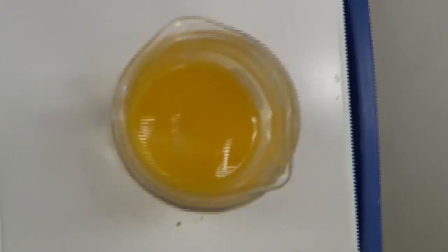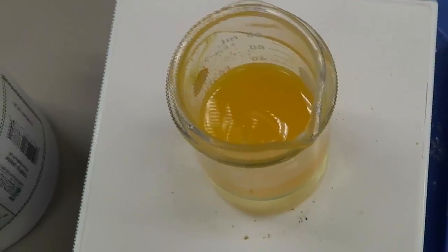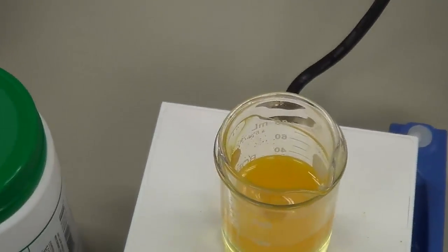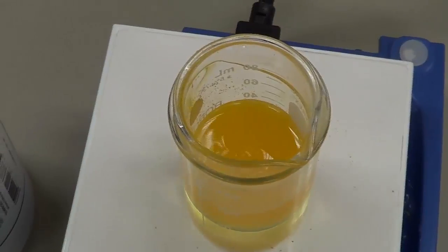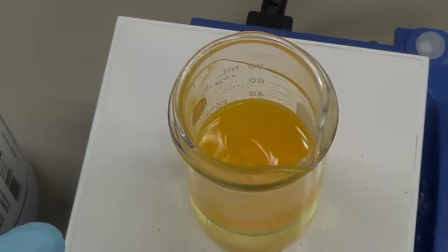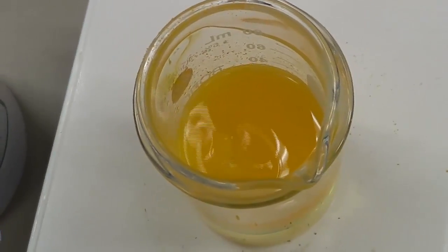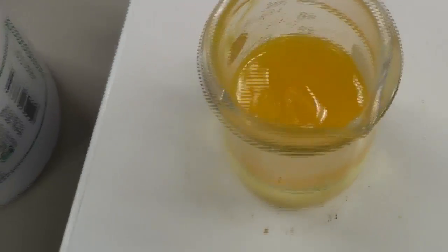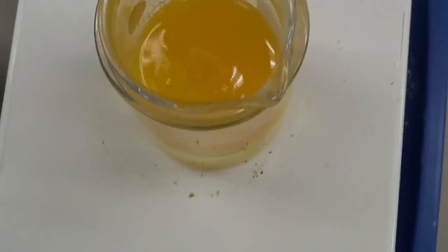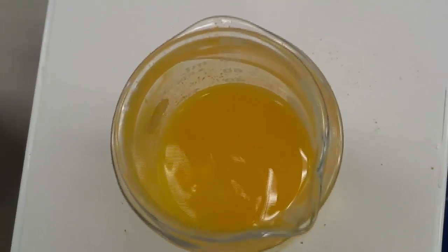Here are a couple of questions before we go further. I hope you remember the double casting technique. If you are aware of the double casting technique, you know the density factor calculations. The amount of base that I'm using for these troches is based on the earlier calculations that I already did. If you don't have the density factor, make sure you calculate it and work out how much base you need. On top of it, also take 10% extra for the drug and also for the base.